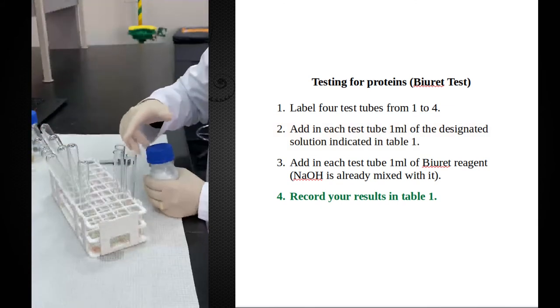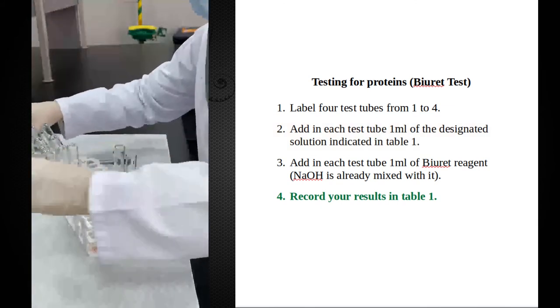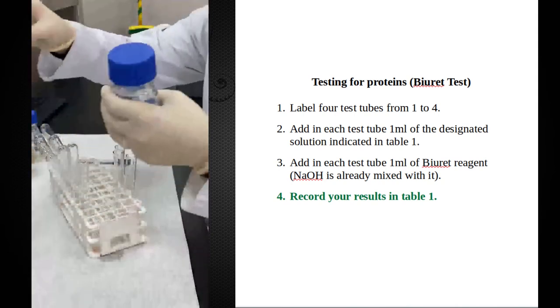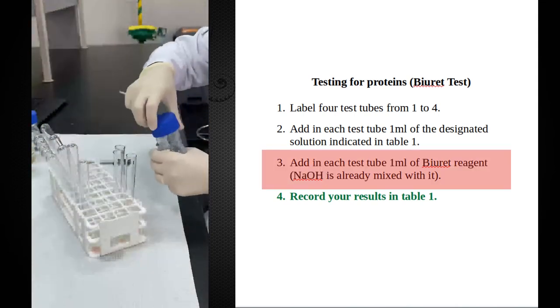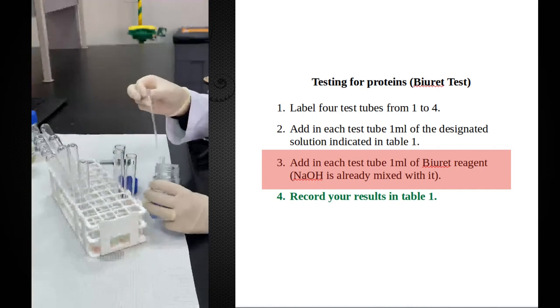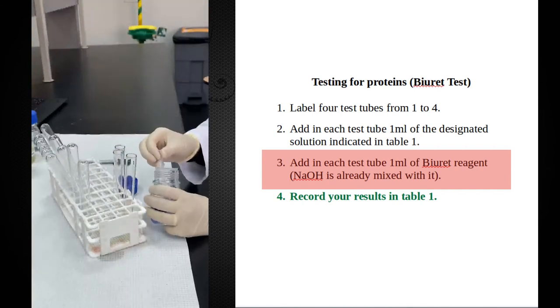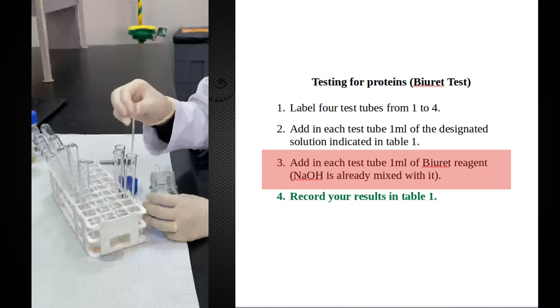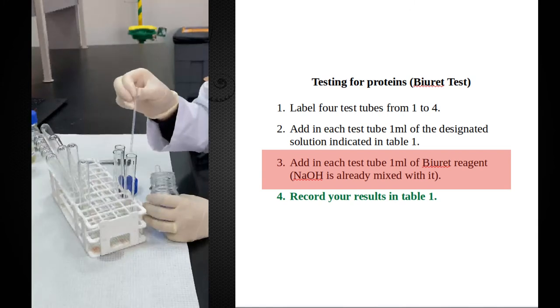In this test today, our lab technician has prepared for us Biuret reagent with NaOH in the same solution, so we don't need to add NaOH. All what we have to do is to add 1 ml of the Biuret reagent to each of these test tubes, as discussed in the lecture.